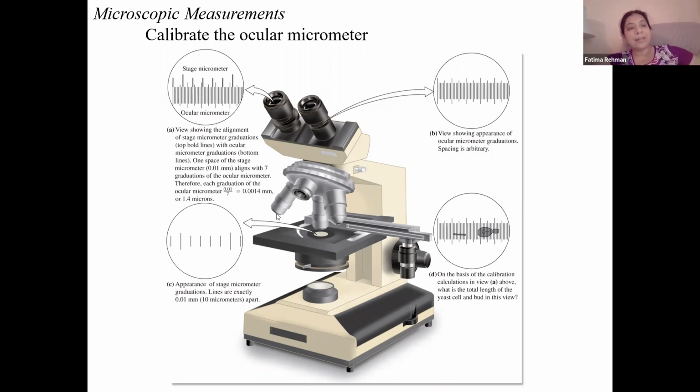So other than Benton, somebody else, what would be the final magnification of the images that you will receive today for analysis? So remember, it's a 40x objective lens and a 10x ocular lens. So 100x is not correct. No, try again. 400x. Good job. Benton, I thought I told you not to respond.